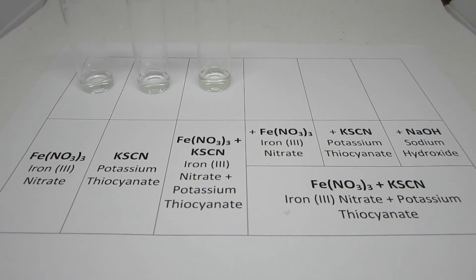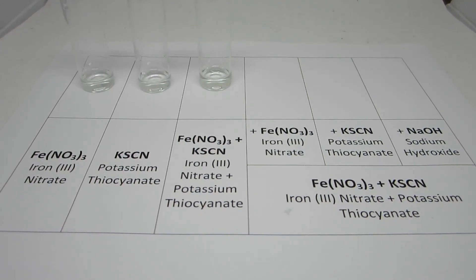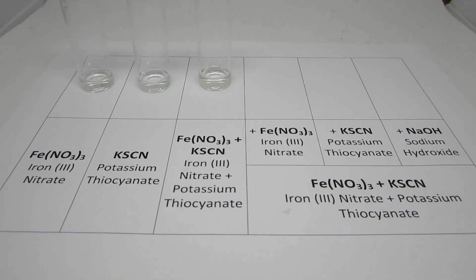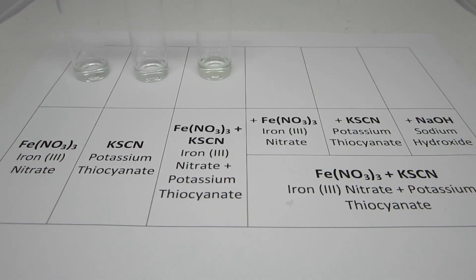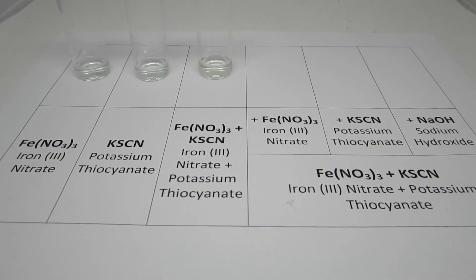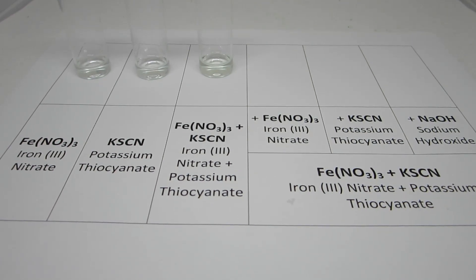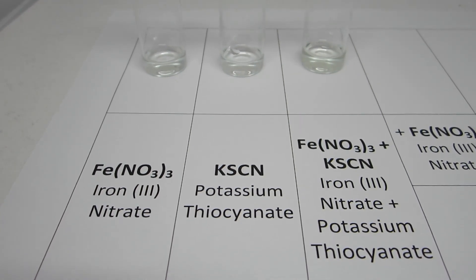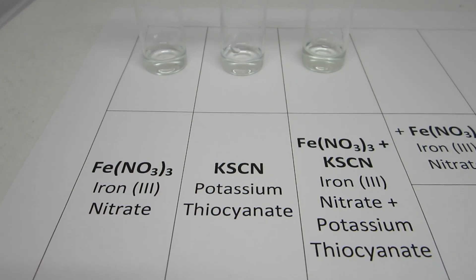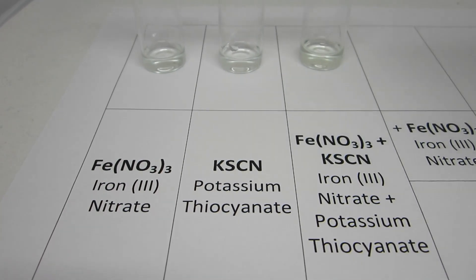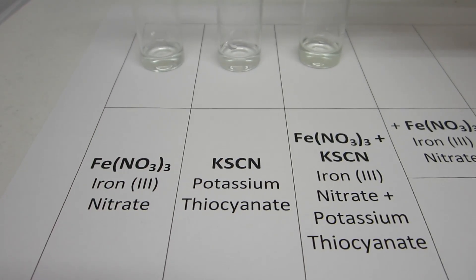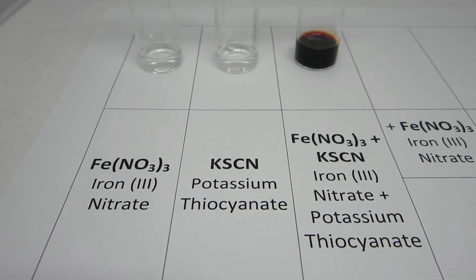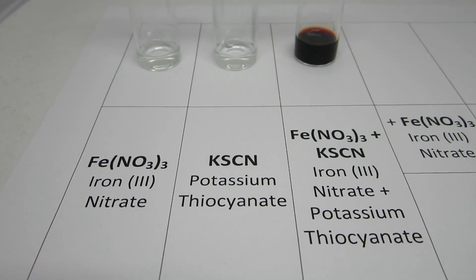In the fifth equilibrium reaction, iron(III) nitrate is again used and reacted with potassium thiocyanate. The reaction produces the complex ion of iron thiocyanate. Both the iron nitrate and potassium thiocyanate are clear and colorless solutions; however, upon reaction, an intense deep red color is produced, which is the signature of the iron thiocyanate complex.